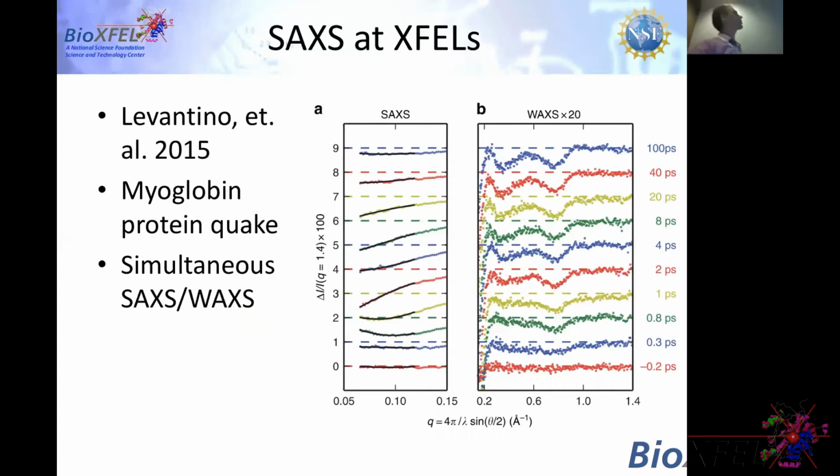Subsequently, there was also SAXS done at XFELs. This work by Levantino had actually combined SAXS and WAXS.